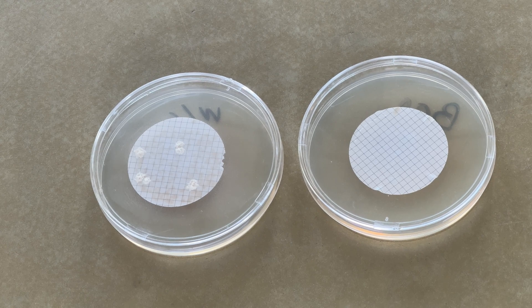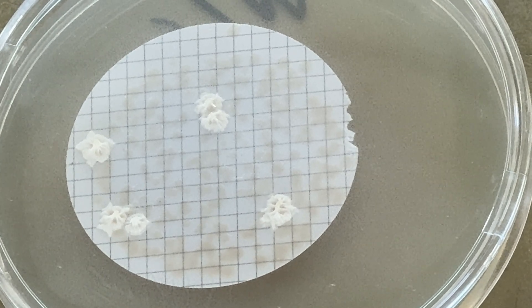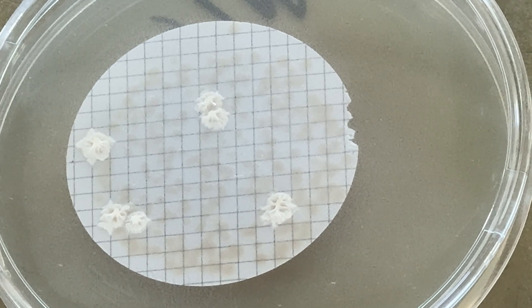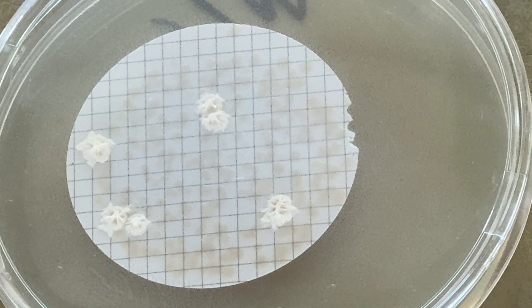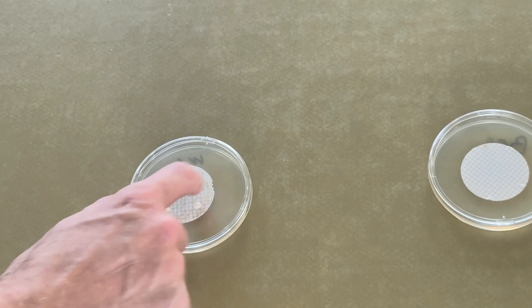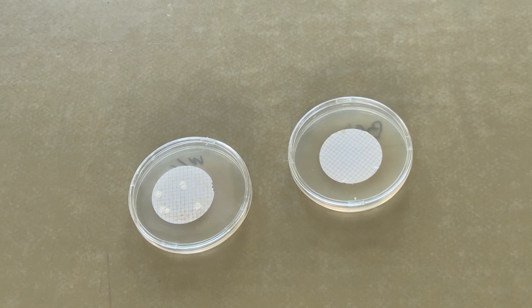I'm not doing this in a sterile environment, and I don't think anyone who's DIYing their fog juice is. Taking a closer look at the plate, it looks like a yeast, but I am not a microbiologist. Identifying stuff on a petri dish from colony morphology alone is questionable at best. I'm guessing it's just a very common, ordinary strain of yeast that we breathe in thousands or millions of spores of every day and it doesn't affect us. But it does show that what will grow on one will not grow on another — and that's my concern. I'm going to continue this experiment, taking another sample in a week and then a month, to see if we get anything new or changed. I am now very interested in seeing the results of all this.